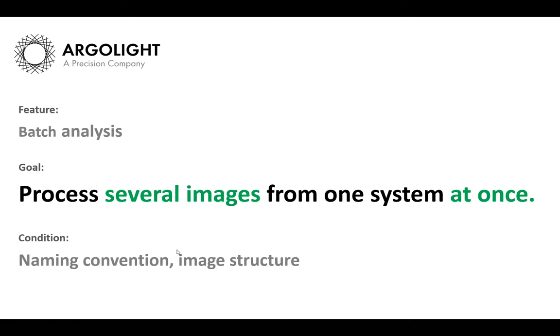Now, with the new batch analysis feature, once you upload all the images in the Daybook analysis, you just have to set up the batch analysis, and the software will analyze all the images at once. So no more talk, and let's demo this feature.